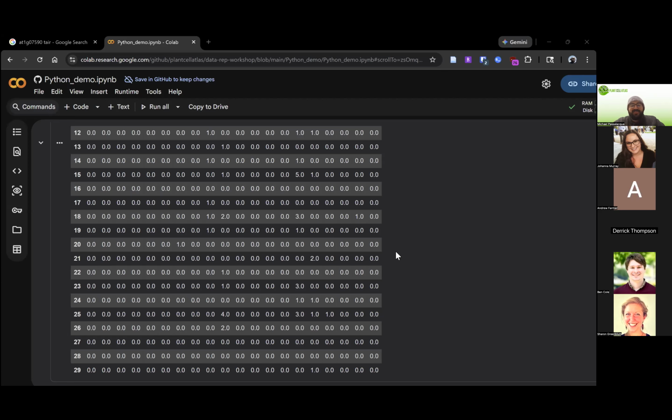Your opinion on how many biological replicates one should generate for a single cell analysis? Great question. I would say personally 3 batches is how many you should generate. I think there are probably some people who have an opinion more like 6, but I think 3 is really the minimum for batches that you'd like to do. This also depends on whether you're doing a pilot experiment versus an analysis. It really depends on what you're trying to do or what you're trying to show. But having 3 batches is helpful.